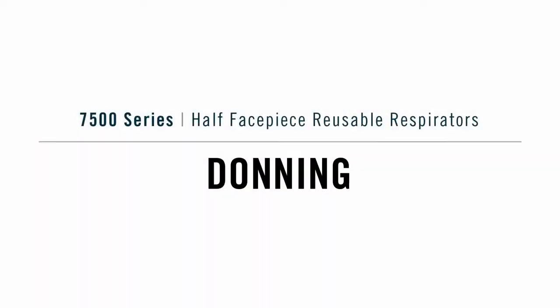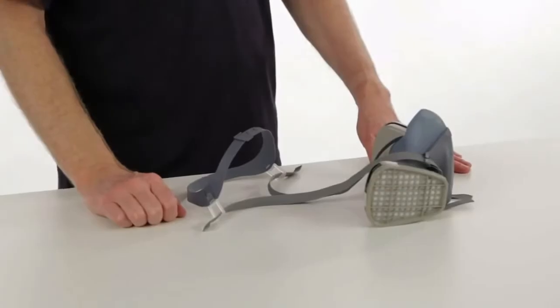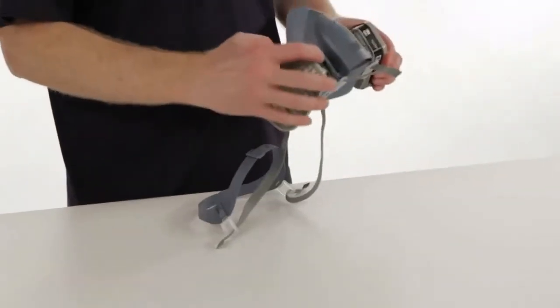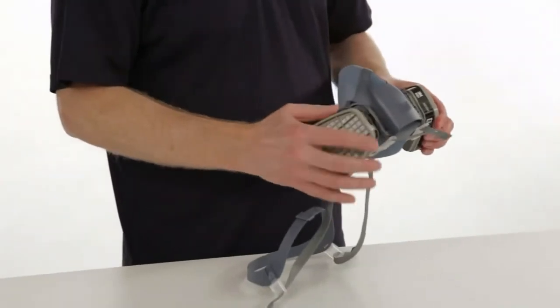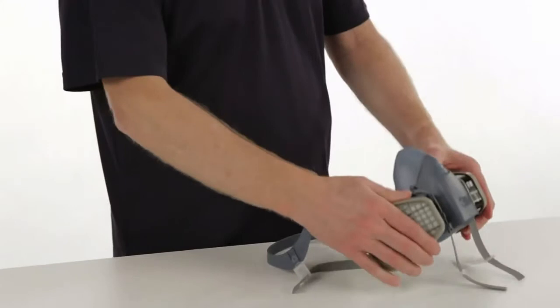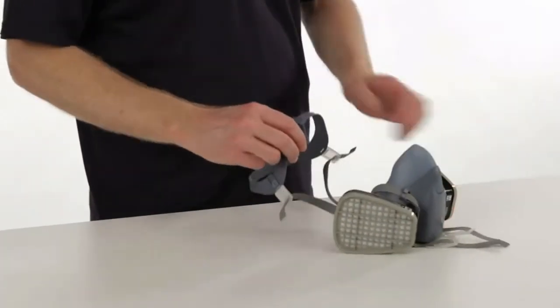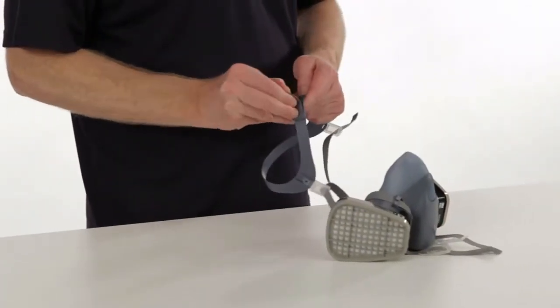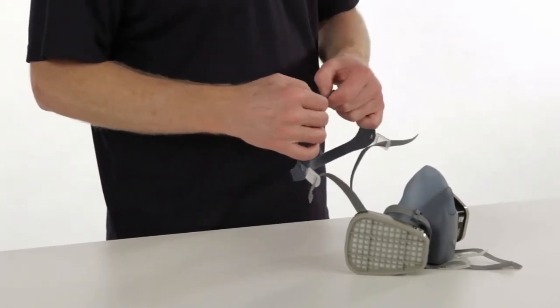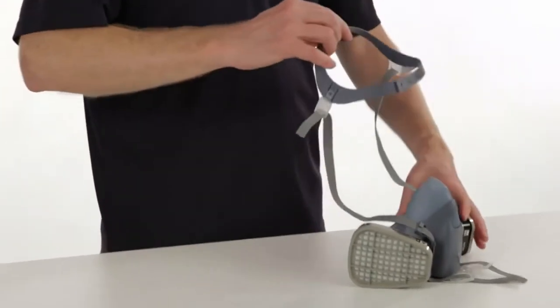Donning 7500 drop-down. Now let's cover donning in the drop-down suspension mode. Before you put on your respirator, make sure the straps are over the locking tabs, untwisted, and pulled far enough through the buckles to permit easy grasping. Adjust the head cradle size as needed to fit comfortably over your head, and place the cradle on your head.